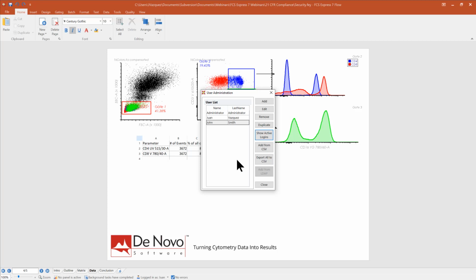Okay, if you have any questions about that, please contact us at support@novosoftware.com and we'll provide you with more information about how to format that CSV file. That CSV file does have to be formatted specifically. It does need certain column names. You can find all this information on our website, or you can just contact us at support@novosoftware.com for more information about that.